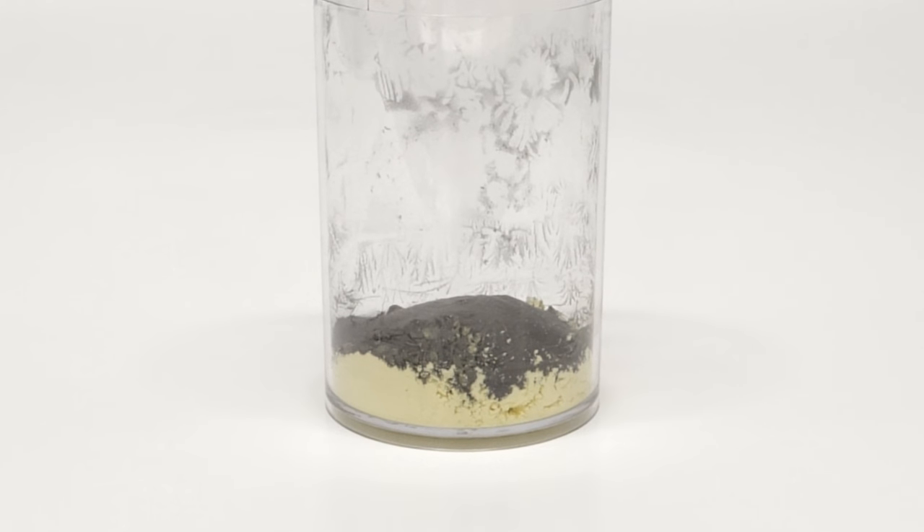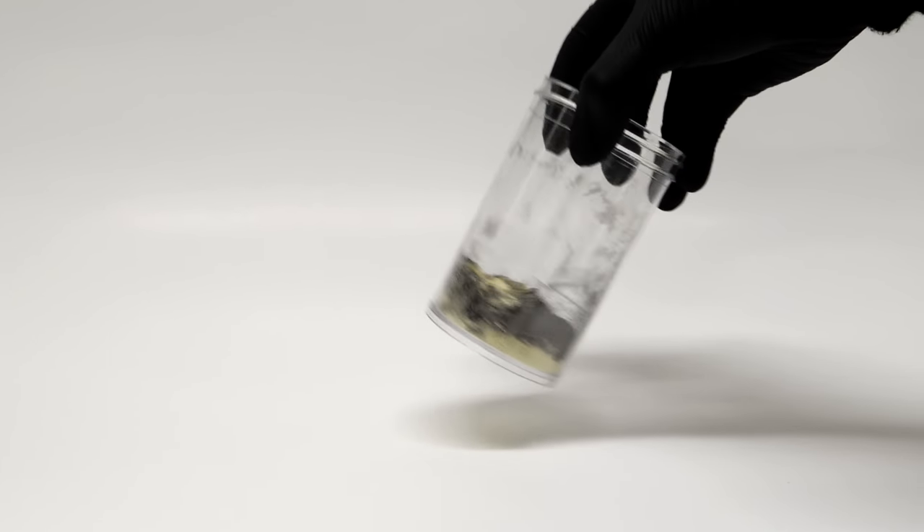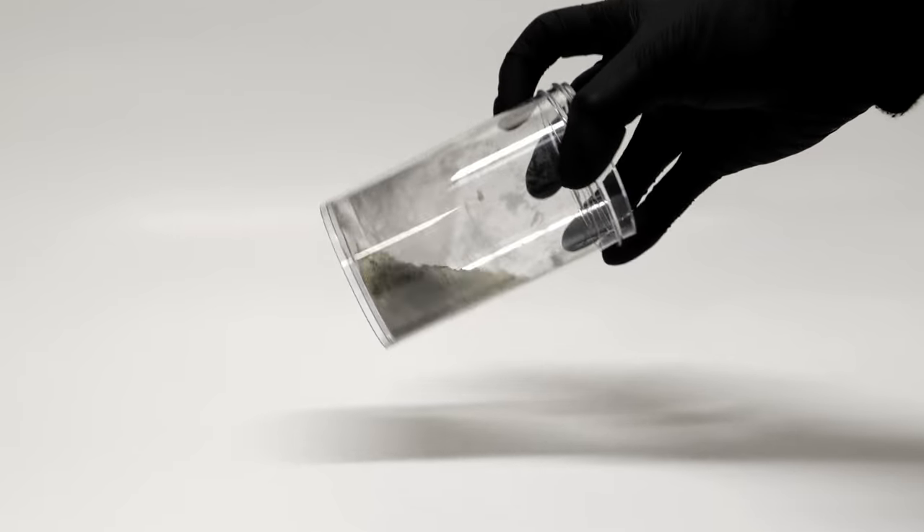This mixture can be a bit unstable, and stirring it normally can sometimes cause it to go off. So instead, I'll just carefully shake it around until it looks evenly mixed.